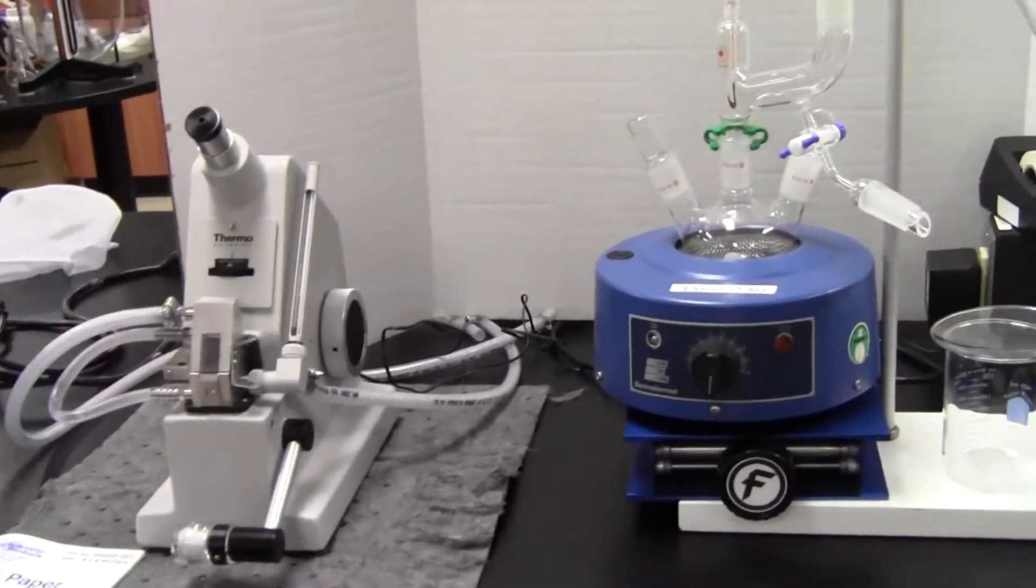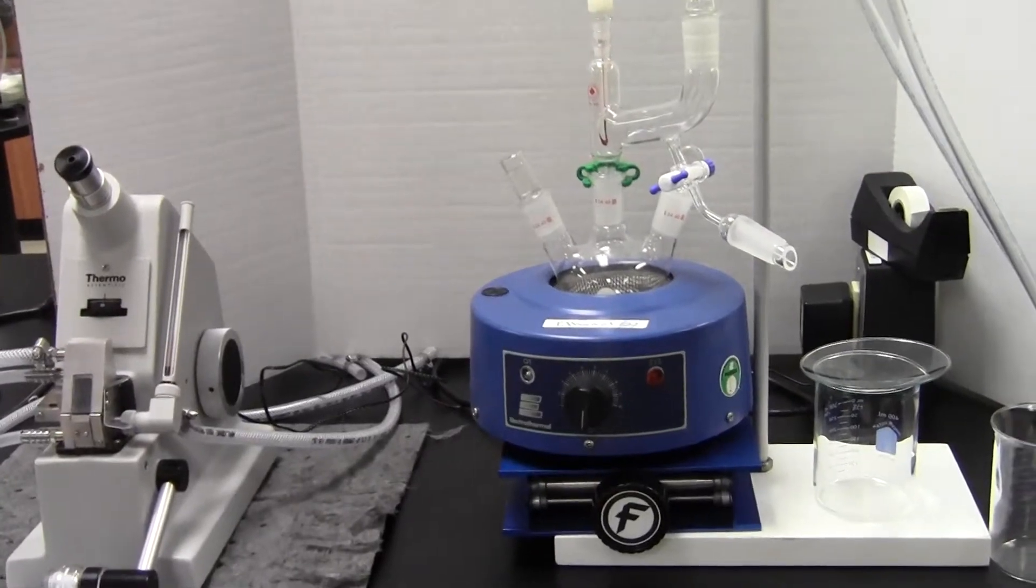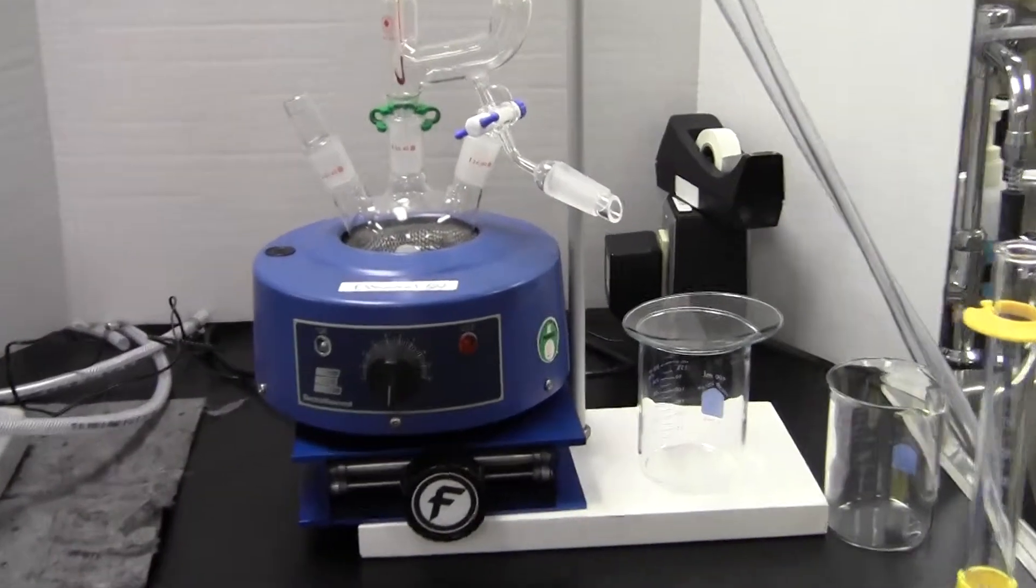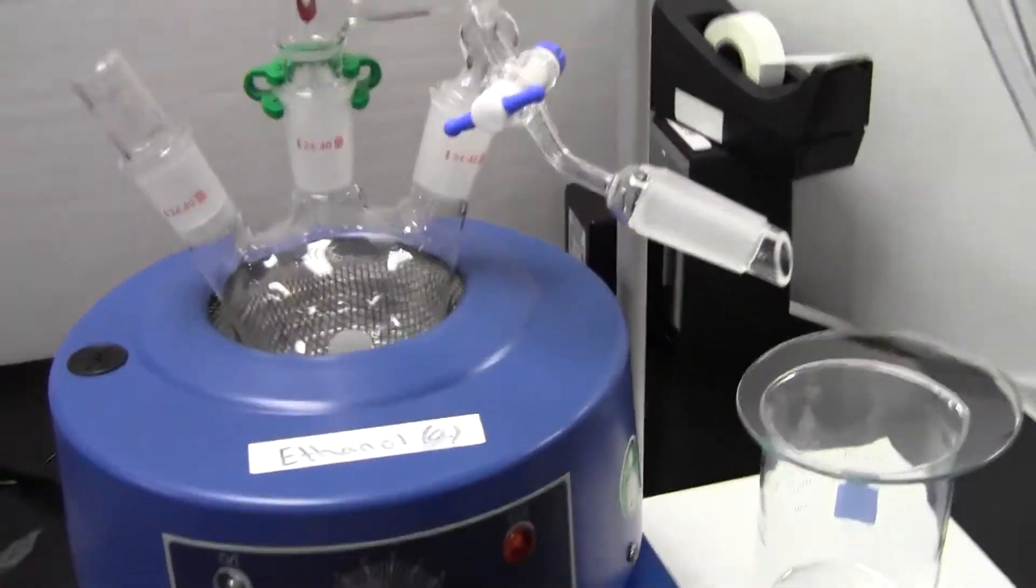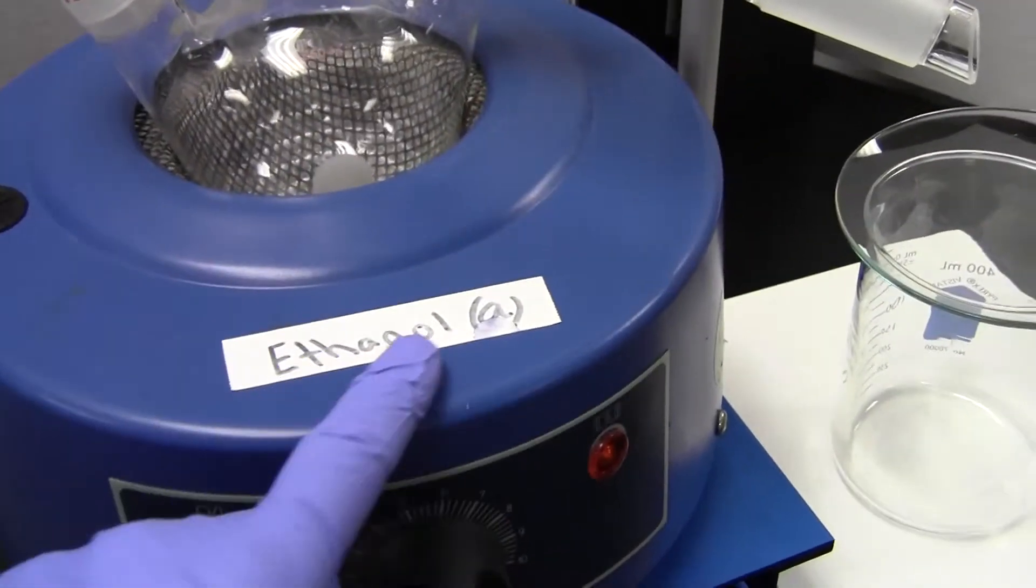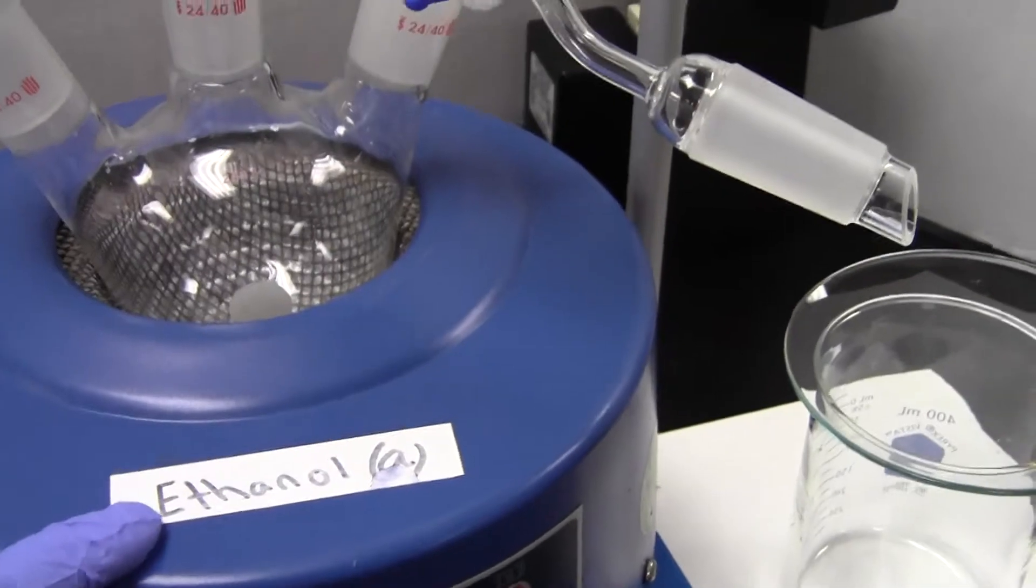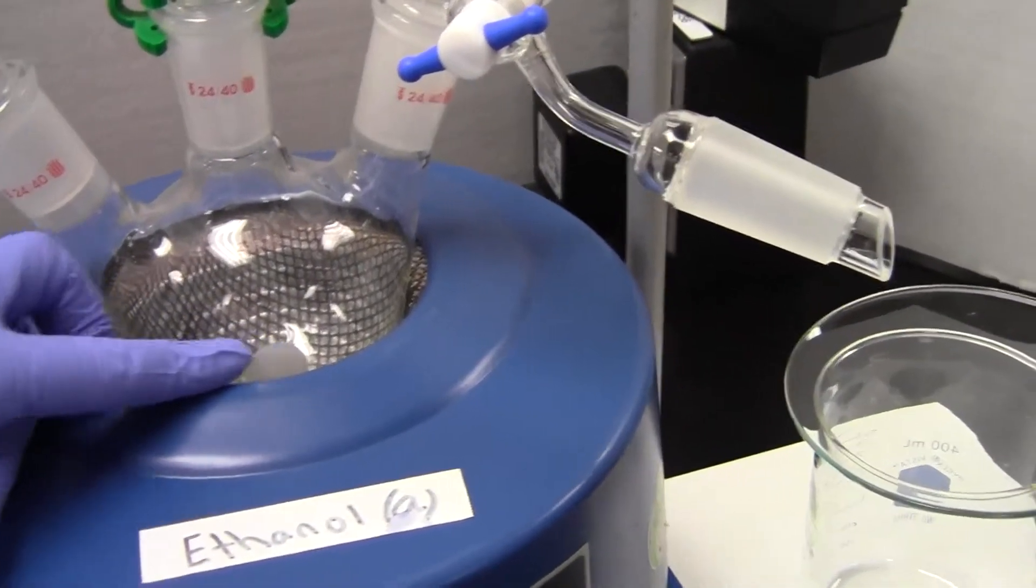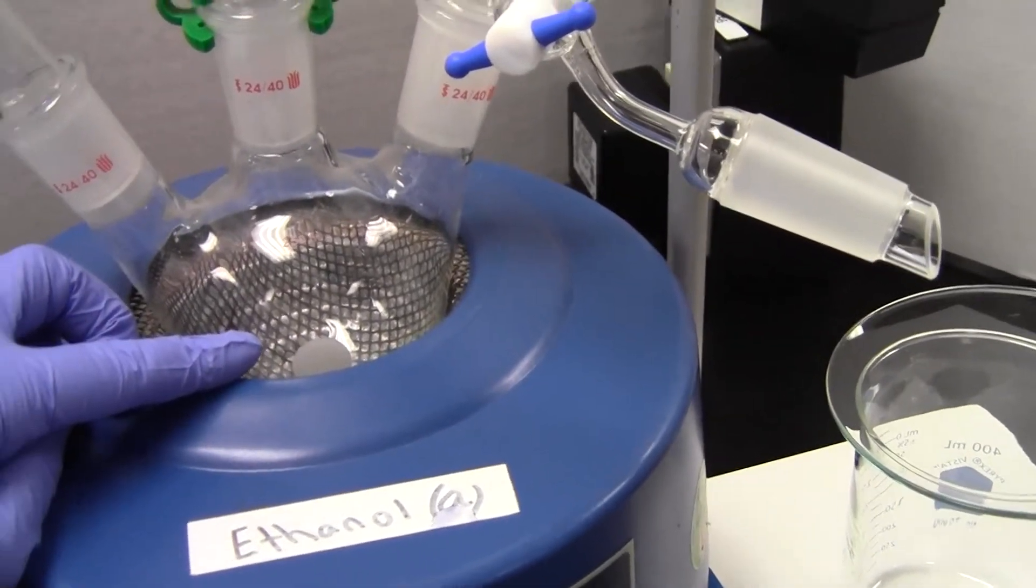This is a quick pre-lab lecture for the liquid-vapor phase equilibrium lab. You'll start by putting one of your liquids, labeled ethanol, into the flask. Your lab manual says to start with 65 mils, but that won't be quite enough, so check with your instructor to make sure you're putting in the correct amount to minimize heating dry glass.